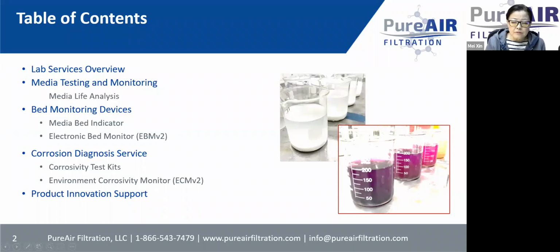So in this presentation, I will focus on the following topics. First, I will give you an overview of the lab services we provide at Pure Air, followed by the topic of media testing and monitoring, which breaks down into 3 different areas. First one is media life analysis. It's an in-house lab analysis to project media life. And followed by the bed monitoring device and electronic bed monitor device, which are on-site testing devices, which can also help you to determine your media life.